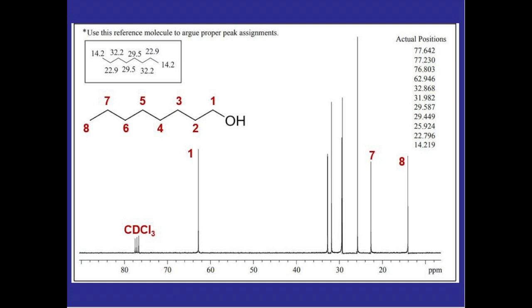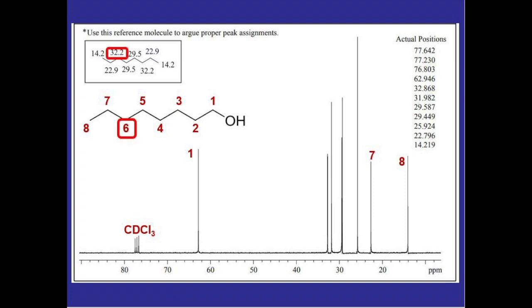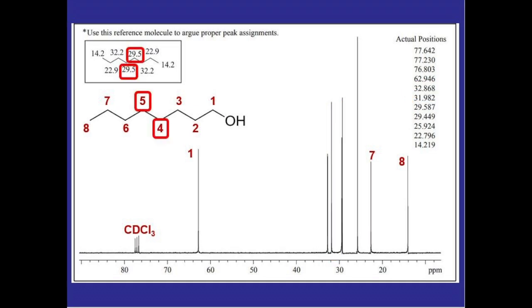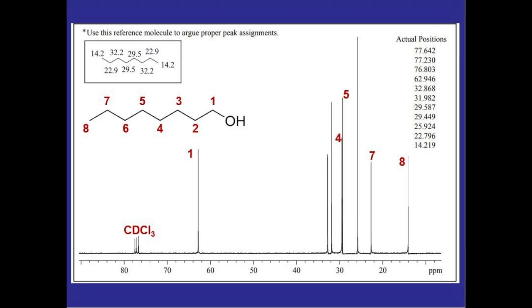As for carbon six we would expect it to be around 32.2 but we actually see two peaks around that range so it's hard to tell which one is which so we'll come back to that. But if we look at carbons four and five both of them are far enough from the oxygen where they wouldn't really be affected and we expect to see both of them around 29.5 and just our luck we see two peaks right on top of each other around there so we can label those. Now four is on the side of the oxygen so we can assume that it would be slightly more de-shielded than five so we'll label it as such.